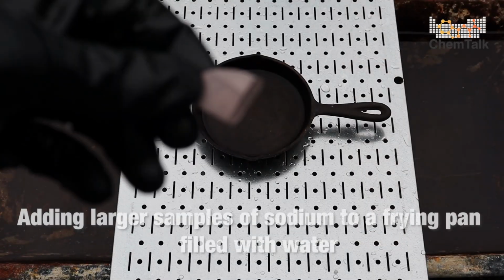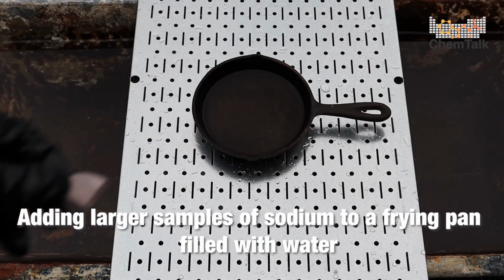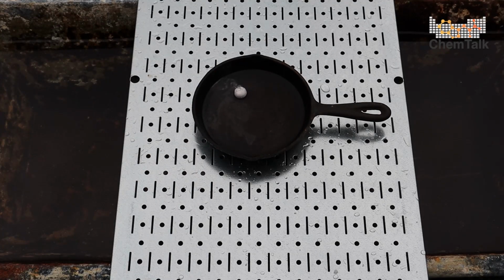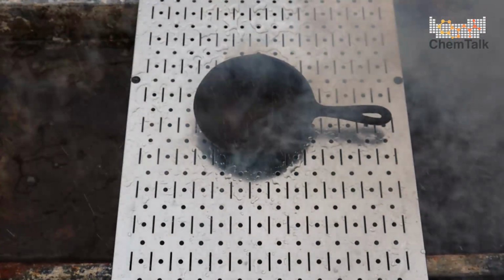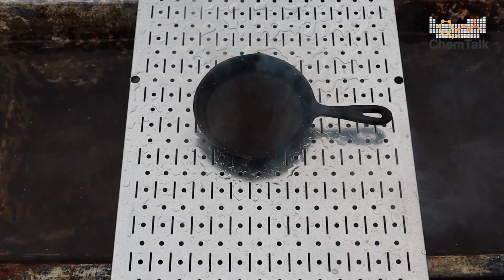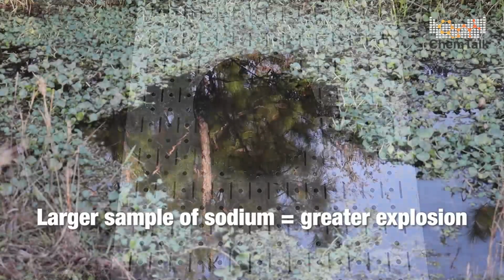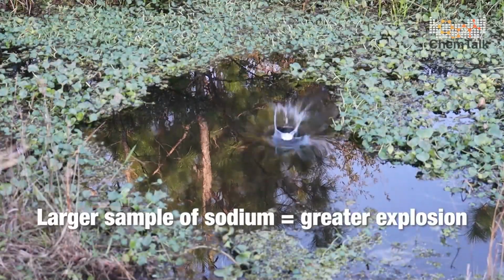Got a little bit bigger piece. Won't be a big one.